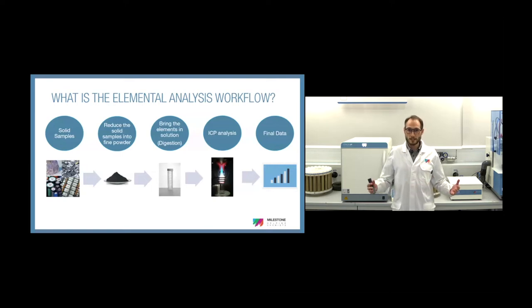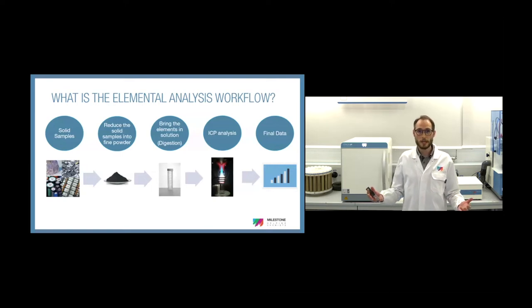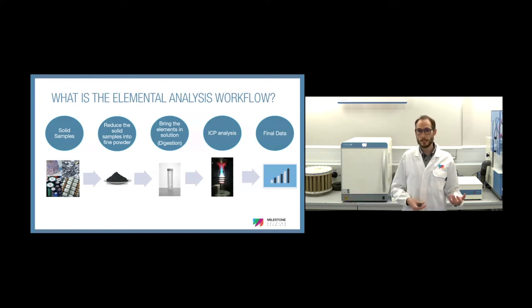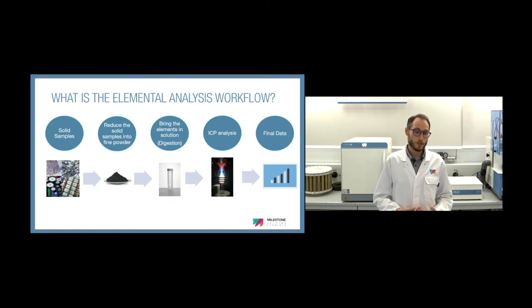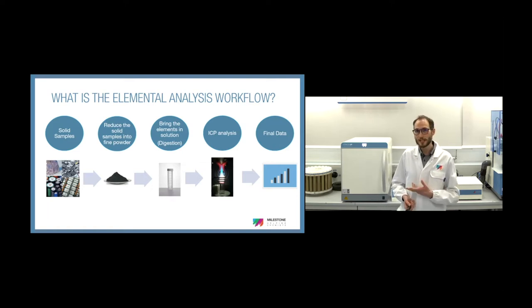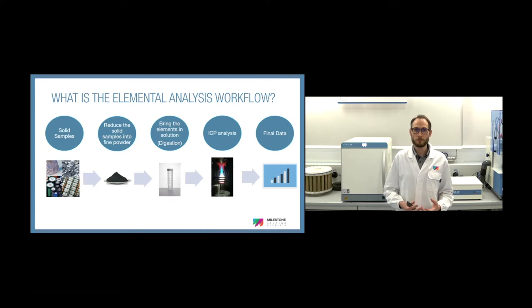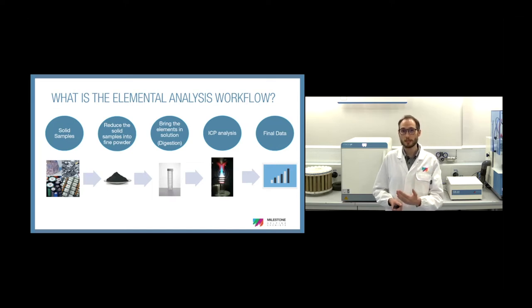The elemental analysis is basically a sequence where we start from the sample preparation, we move to the analyzer, and then we collect the final data. As already mentioned by Jean-Louis, the major system to analyze elements is using ICP. And the ICP system works with liquid solutions. So it is not possible to inject a solid sample into an ICP. That means you have to do a sample preparation in order to dissolve the solid particles into a liquid phase that can be injected into the ICP system.